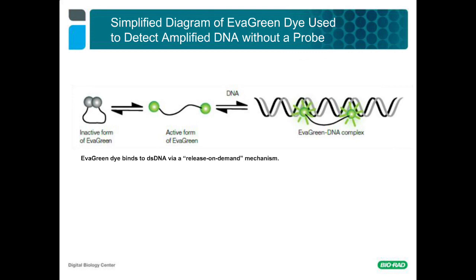Benefits include new applications such as detecting longer amplicons, shorter amplicons, breakpoint mutations, and splice variant quantitation. Generally, longer amplicons have higher fluorescence due to having more dye bound per amplicon, and shorter amplicons have lower fluorescence due to having less dye bound per amplicon. This has important benefits with ddPCR and will be discussed in more detail later.